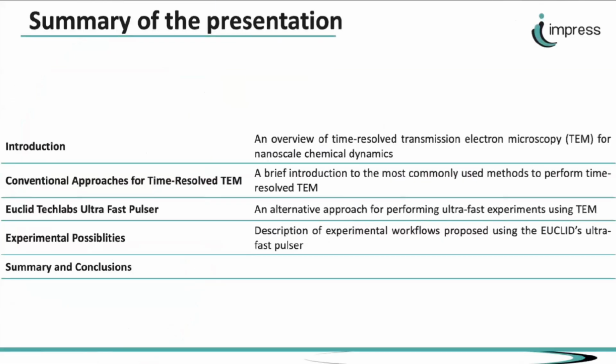To summarize my talk, I will give you a brief introduction about the time resolved measurement in TEM, and then immediately we go through conventional approaches that have been employed in the TEM community. Then I will switch to the major modifications that we have made in our instruments to perform such experiments. And at the end, if time allows, I will show you some examples of our work over the last 2 years.